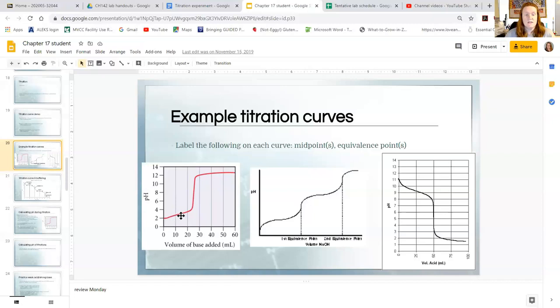Then when you start to see, and you don't know where this point is going to be, it'll be different for each setup. But when you see this increase start to occur, in other words, the pH is increasing much faster than it initially does, then you want to start taking more and more frequent measurements.